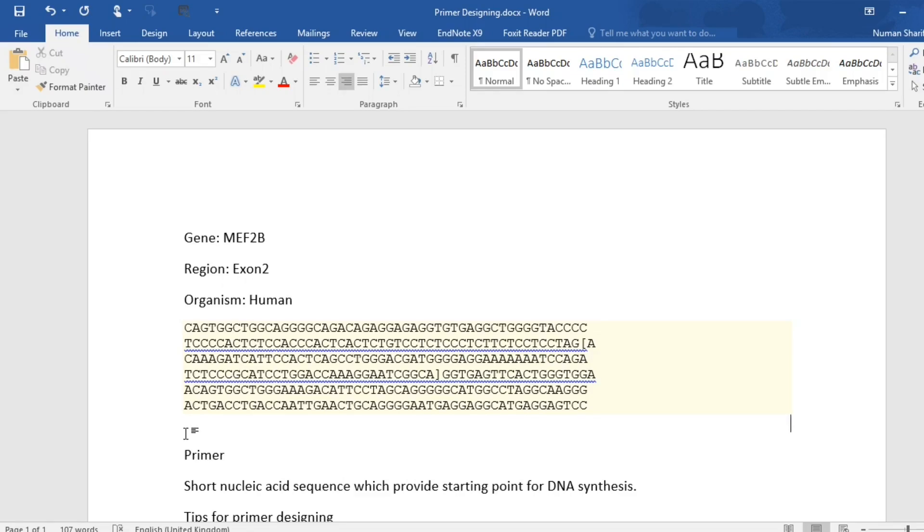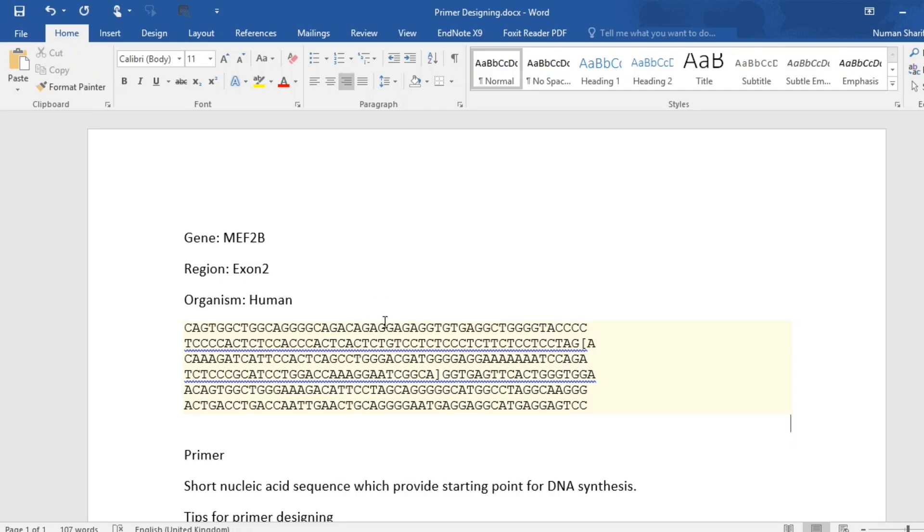Hello guys, in this video I will show you how to design primers using Primer3Plus. I will assume that you know how to get the sequence of any gene using different genome browsers.